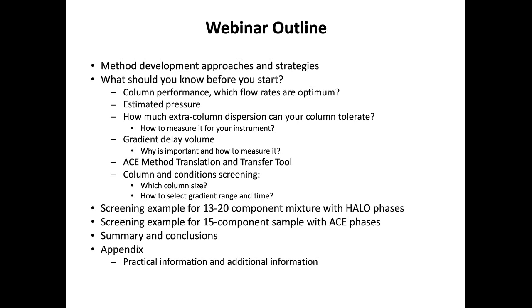Then we'll go through some things that ideally you should know before you begin that work, including understanding your column, understanding how much pressure it will produce under various conditions, the importance of extra column dispersion and how much your column can tolerate, how to go about measuring it with your instrument, and why it's important to measure and know what the gradient delay volume is. We'll mention the ACE method translation and transfer tool.